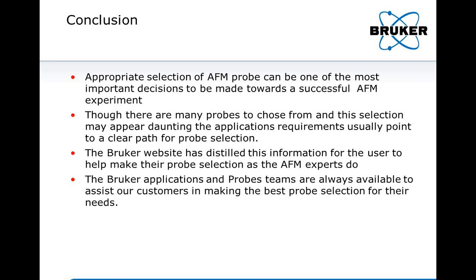Okay. Sort of along the same lines, still in QNM, how do you match the sample stiffness to the probe stiffness if you're trying to figure out what the sample stiffness is? That's a very good question, and you do have to iterate to find the right match. It is pretty clear when you're scanning whether you cannot get enough deformation or you cannot get enough signal, and that lets you know pretty quickly. Okay.